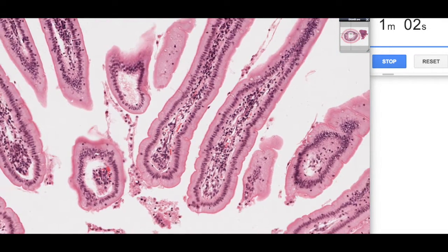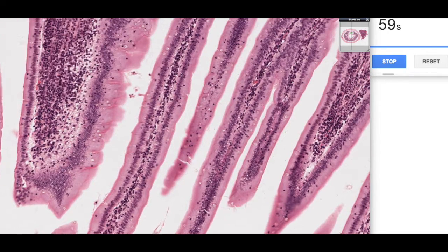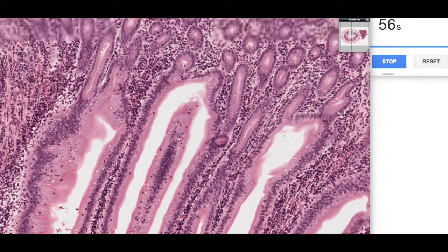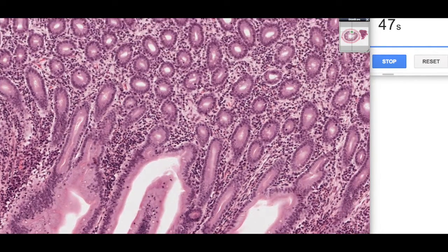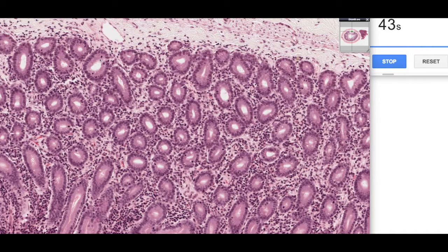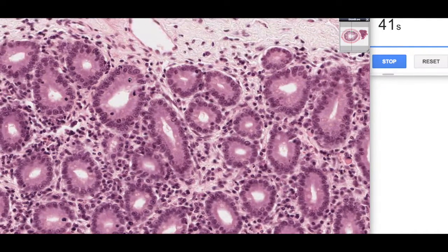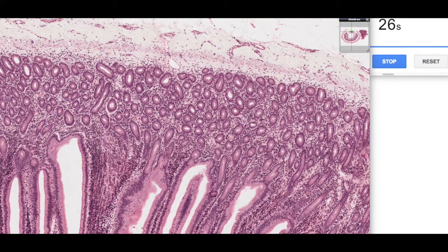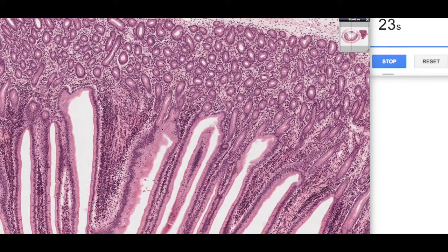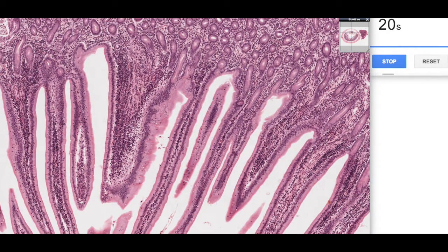If we follow this villus down toward the base, we can see it extends down into these circular profiles — these are the intestinal glands, or what we call crypts of Lieberkühn. They extend right down to the base, and these very dark chromatin profiles are evidence of mitosis taking place there. The cells found on the surface of the villi actually originate through mitosis in the crypts, then migrate up via the intestinal glands onto the surface, where they are eventually shed.